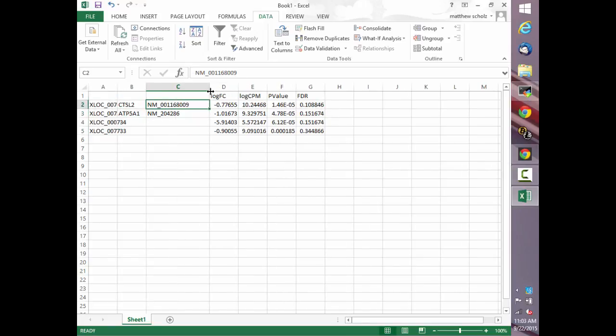So of those 4 genes that I copied, 2 were novel, or essentially novel, right? They didn't have a previous gene ID associated with them, and 2 have those gene names. So what can we do with that information? Well, we can look up the genes individually. We can go to Ensembl or NCBI and look up that gene ID and see what gene it's associated with.